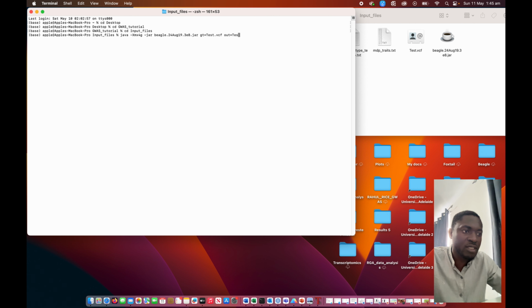Let's call it test1. All right, and then you ask Beagle to impute. So impute=true, and you just enter.